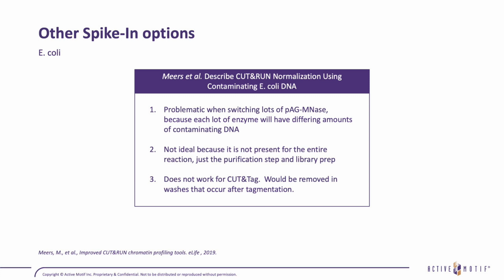And then lastly, for E. coli DNA, it's really not going to work for CUT&Tag because it essentially will get washed away during the washes for CUT&Tag. So I just wanted to point out that, although there are other spike-in methods available, there are some caveats that go along with using them.